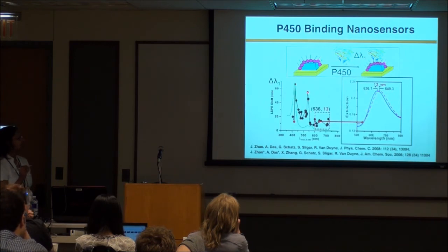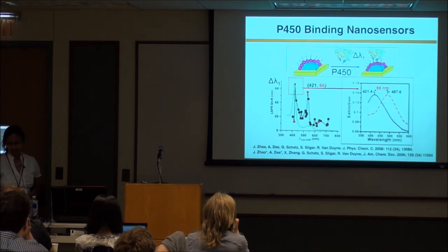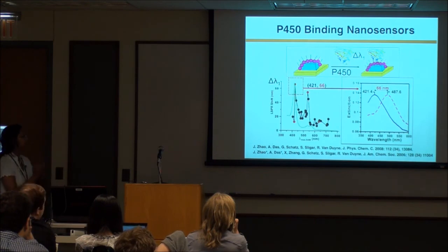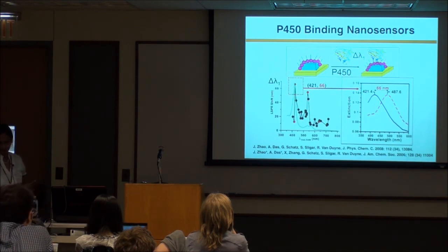We also see another plasmon resonance effect here. There's a coupling here, this huge shift, and you would think, why is this huge shift coming? This is actually coming from the Q band. It took us a while, but we were unable to explain why the extent of the shifts is similar to that of the Soret. So we are still working on it. We saw that there's a 66 nanometer shift, which is quite a lot of shift on the nanoparticle resonance when it's slightly red. I remember this particle being around 420 nanometers, slightly red. 417 is the spectrum of the Soret of the protein.